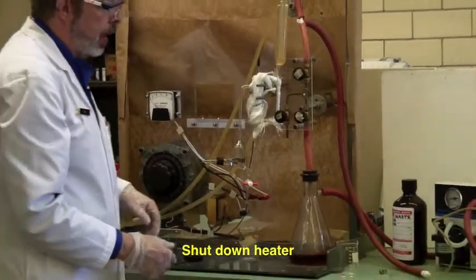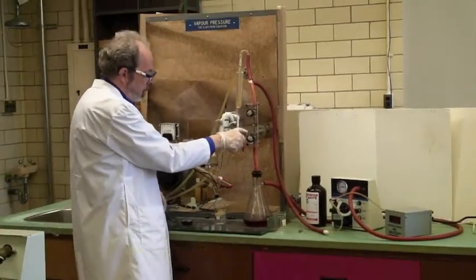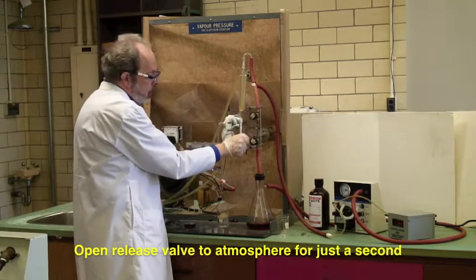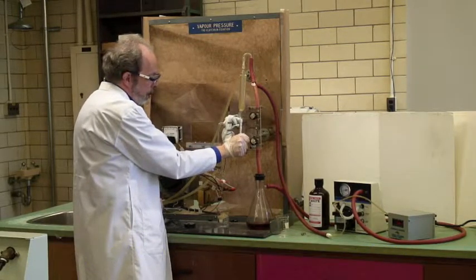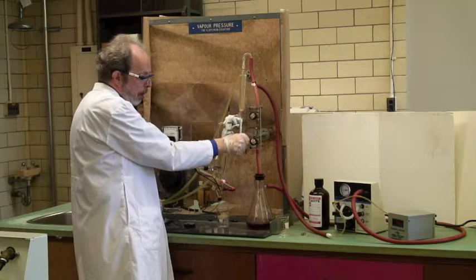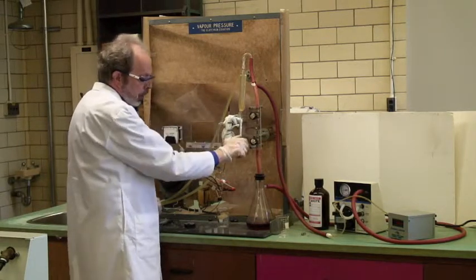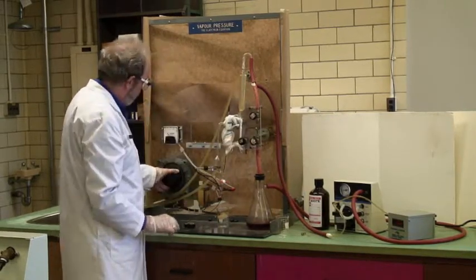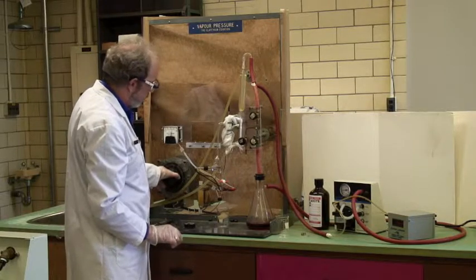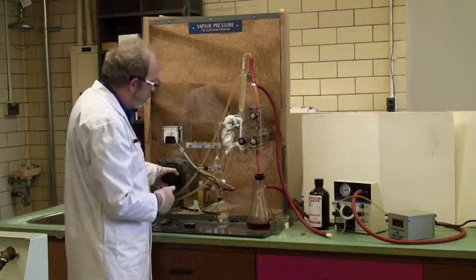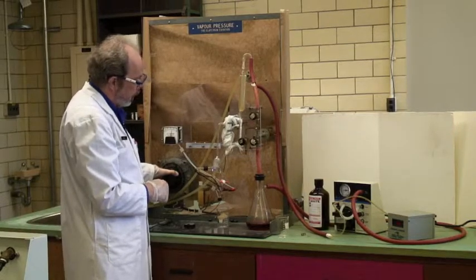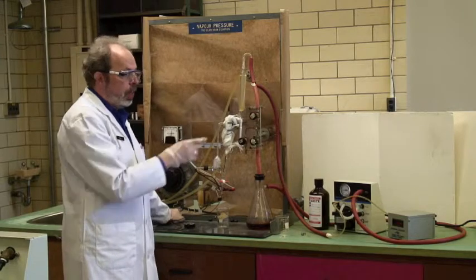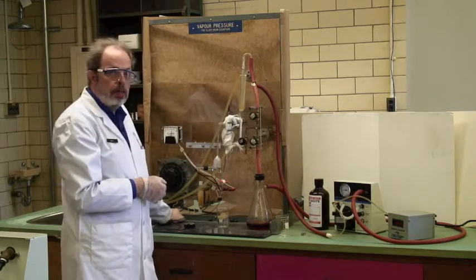At this point, we turn this down, and this is the release valve here, and open it righty tighty, lefty loosey, so counterclockwise for just a second. You'll see the pressure going up. I took it up to about 63, and then we turn the heat up again, and it'll start boiling a lot faster this time because I'm not taking it from room temperature, and again we'll measure the boiling point. And you continue to do this until your pressure gets up to atmospheric.